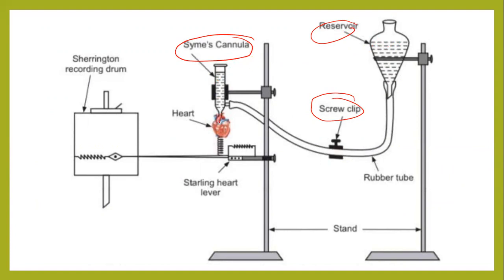And at one end of this Symes cannula, we have attached the isolated frog heart. At the apex part of it, we have attached one end of the spring, and the other end of the spring is attached to the Starling's heart lever.